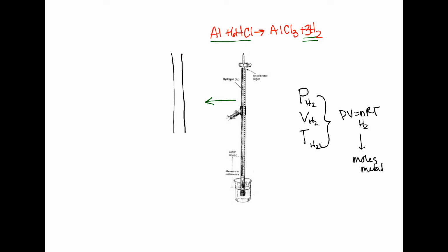So a burette has a stopcock at the bottom, kind of like a little twisty thing right there. And remember when you were using burettes, they are 0 at the top, and then down at the bottom is the 50 mil mark. So this would be like 49, 48. So that's what is now, if we invert it, at the top of our burette.